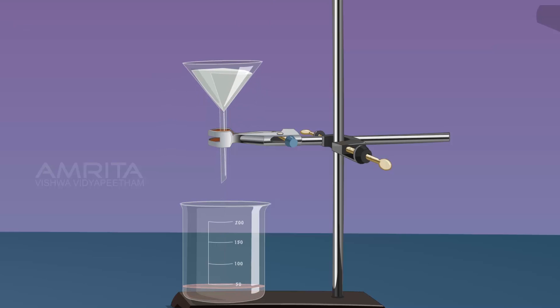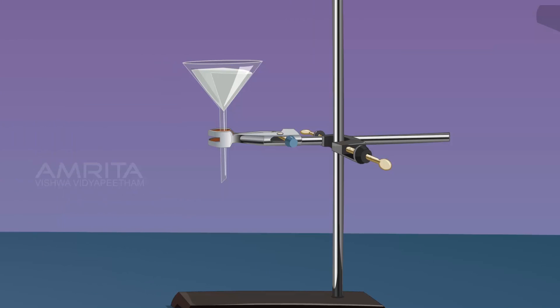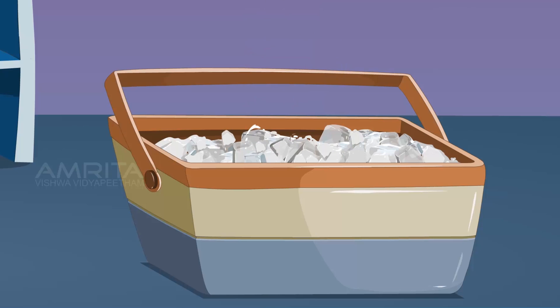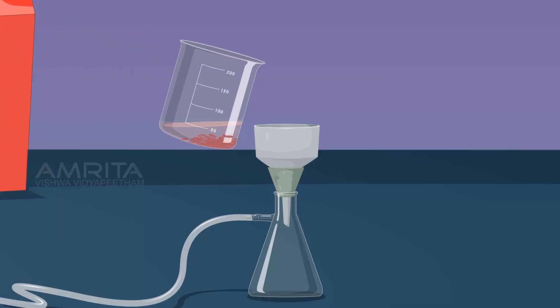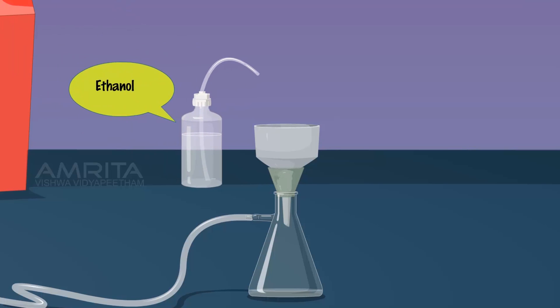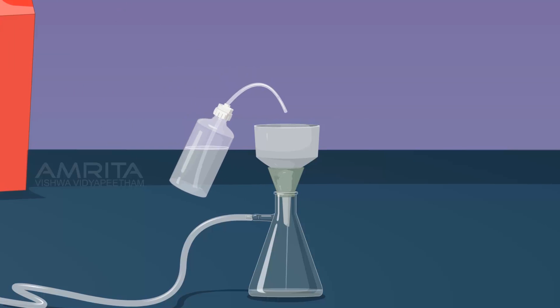Cool the solution by placing the beaker in an ice bath. As the solution cools, crystals of 2-naphthol aniline dye separate out. Filter off the crystals using Buckner funnel. Wash the crystals with ethanol. Crystals of 2-naphthol aniline dye separate out.